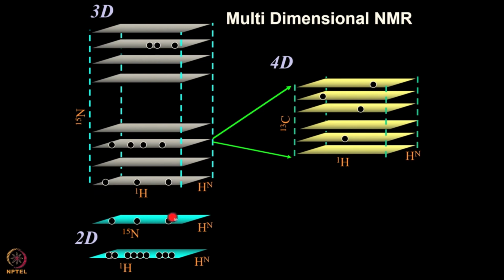So this N15 chemical shift is this one, this one, and this one along the N15 axis. I have here 3 peaks. This may well be the NH to the alpha and then to the 2 betas, maybe threonine or serines and things like that.